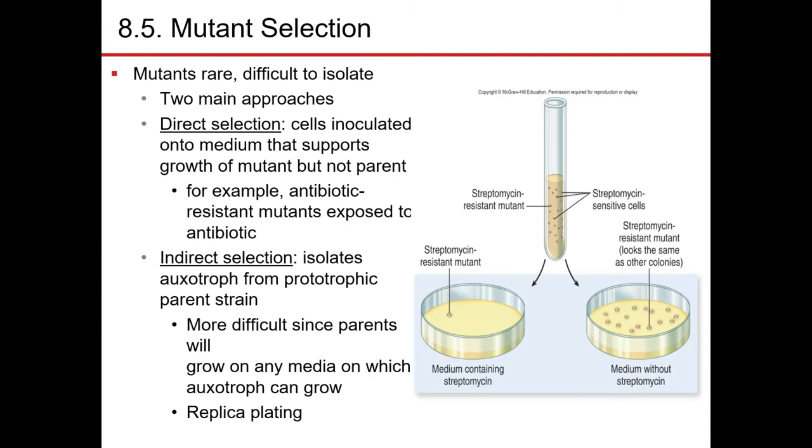Okay, on mutant selection. Because mutation is a rare event, even in bacteria, we must have robust methods of identifying or selecting these mutants. If you remember, mutants are produced either via spontaneous mutations or by induced mutations. Induced mutations happen when we subject the cells to factors such as chemicals or radiation, and mutation happens in the DNA. So the next question is, how would we selectively identify or differentiate these mutants from the original parental wild type cells, right?